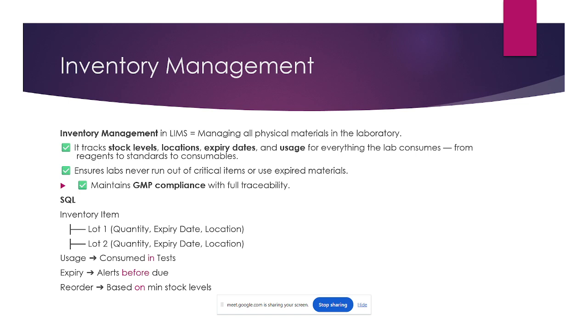So you can check in the application itself. Why? Because however many ml you use, you compulsorily have to enter that much in the LIMS application. Once he enters it in LIMS, then we can automatically see how much remaining stock there is in inventory management.